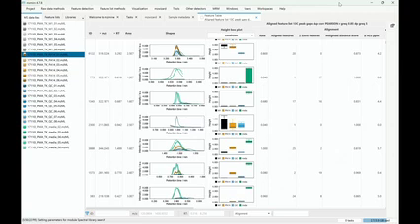I have a question about the workflow. I'm working on some molecules where I don't know the masses, but they have a specific isotopic pattern. So what I'm doing is filtering by looking for similar isotopic patterns in my raw data and then getting the possible candidates. Is it possible to do this with mzmine, and how would that work?